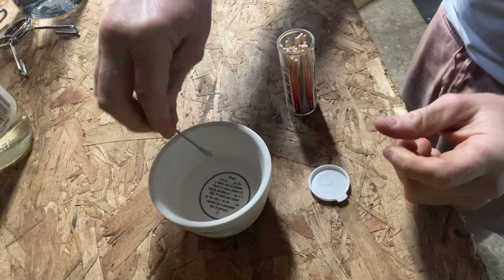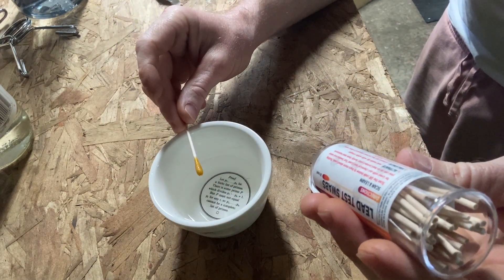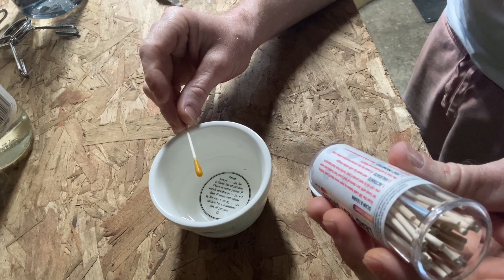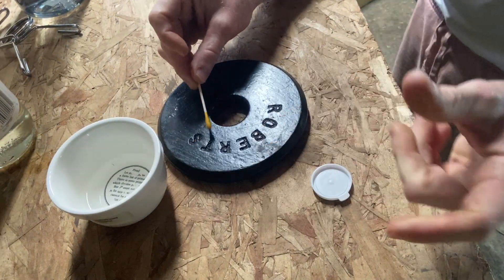So let's wet it. Then it says if the swab tip has turned to mustard yellow color, the test is activated and ready. Rub the surface with the swab tip for at least 30 seconds. Here's my weight, which may or may not contain lead — make sure you wear gloves.